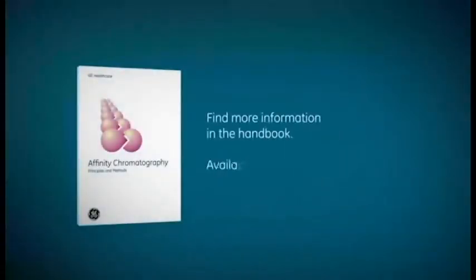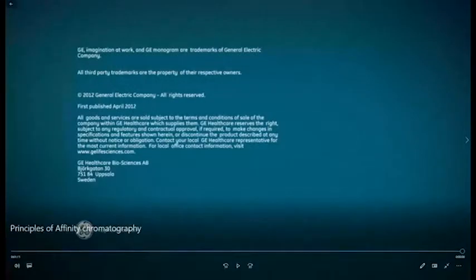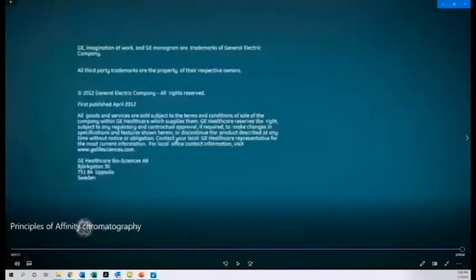So that's the example of the affinity chromatography. Then I'll show you another video. It's about gel filtration.